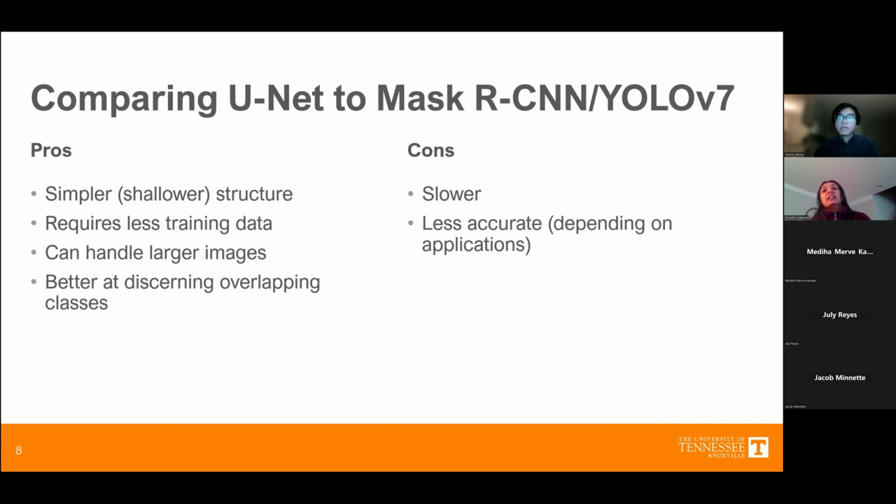And that was the biggest challenge: if you remove the fully connected layer, that means you're passing the image through the convolutions rather than flattening it through neurons. So you would make your model simpler. Here you made the argument that YOLO V7 uses a fully connected layer, but after YOLO V1 there is no such use. They removed it. Right. Other than that, I have one more question. Now, what is the role of skip connections in your model?